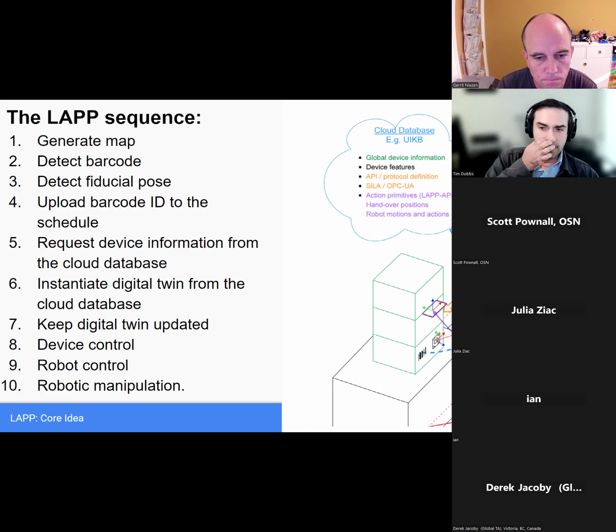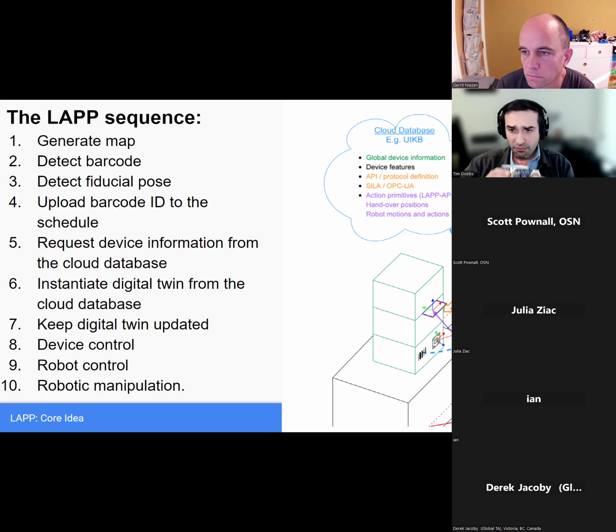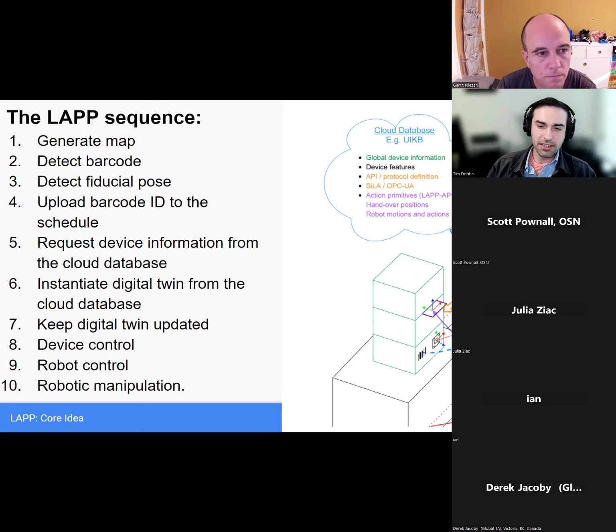They do cite that mobile manipulators like this are not that fast. It's much faster to do an in-place robot. But these guys can work 24/7, and so they make up for their lack of speed by just working all the time. So I think you could imagine multiple robots. I'm not totally clear, and I think the details of the scheduler end up being what's really important there. Is the scheduler really only scheduling devices, or does it also somehow keep track of all the robots and their schedule? I suspect the self-driving car industry has a lot of thoughts on this.